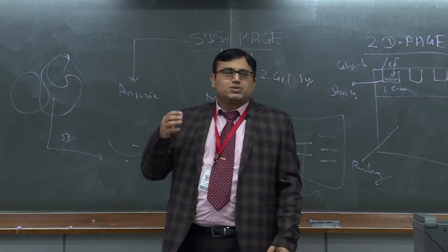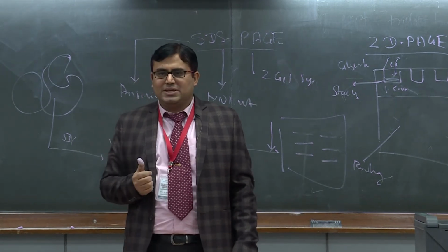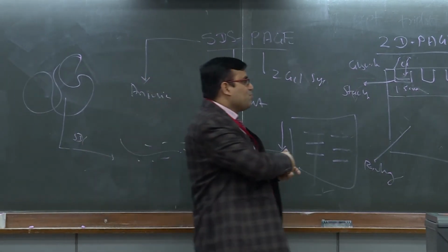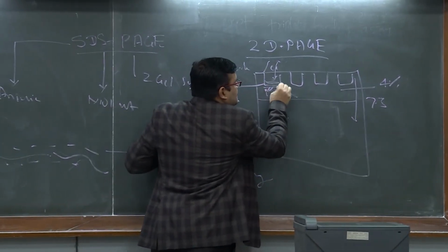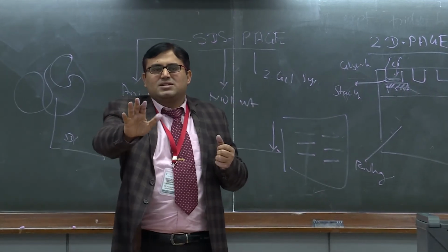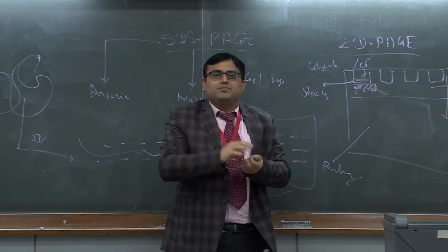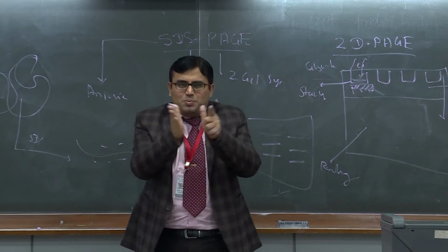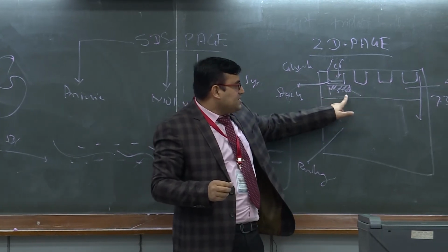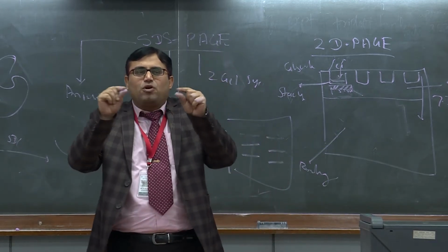So one ion starts showing the dragging, whereas at the same time the chloride ion will start showing high electrophoretic mobility. One is running at fast speed, the other is stopping it, and because of this your protein will sandwich in between, because there will be a ripple. One ion is running, giving a thrust, the other is stopping it. This ripple stops or sandwiches the proteins, and with every ripple the protein will start accumulating, squeezing, and there will be a slow movement also, and by the time it reaches this phase, your protein will be sandwiched and form a uniform pleated structure.